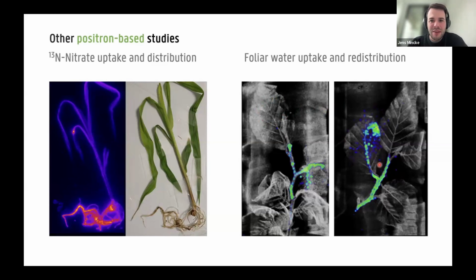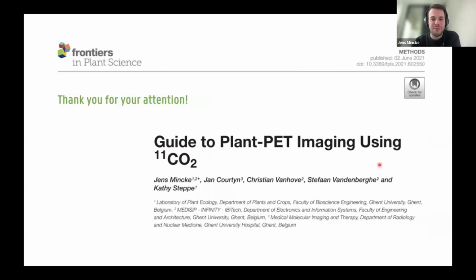These are two examples, but there exist numerous examples, which are summarized in a review paper by Schmidt et al. from 2021, I guess, which summarizes all plant PET experiments that have been performed in the past. And if you are excited and want to perform PET experiments yourself, then I wrote a guide to do this using 11C carbon dioxide or other tracers in this nice article.